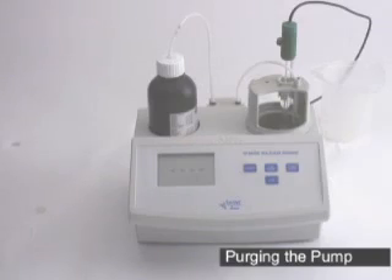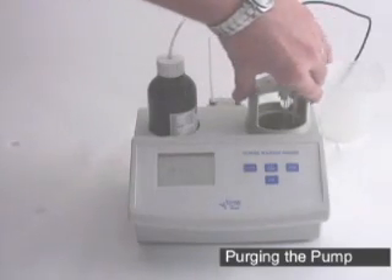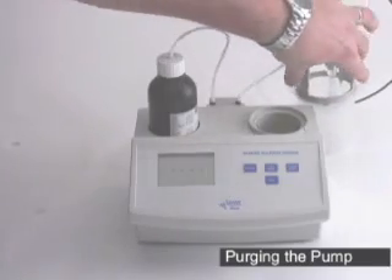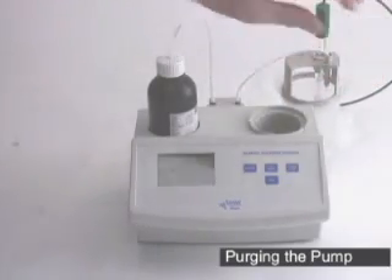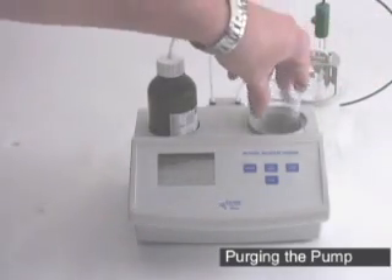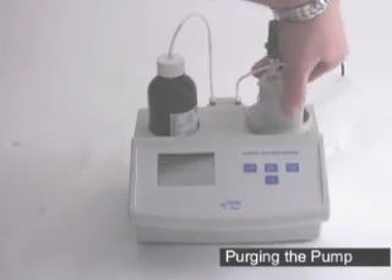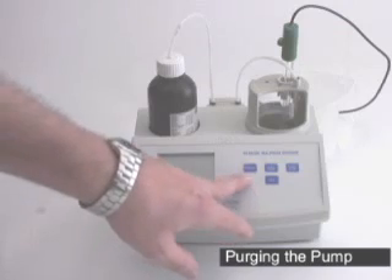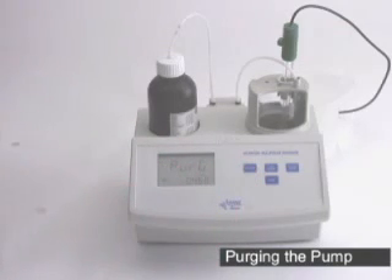Now at this stage, the next thing we're going to do is purge the pump. Your cap comes off with a half turn counter-clockwise. Place it behind you, put a beaker into the machine, and replace the cap and tubing. Make sure your tubing is down into the beaker and press the purge button. The purge cycle will run for five minutes, which will make sure there's no air left in the line. Once the purge cycle is done, we'll move on to calibrating the pump.